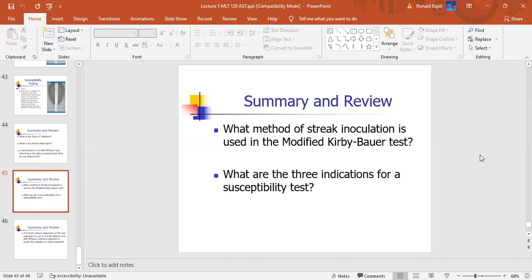The tube. So you do the slide. If it's positive, you stop because positive coagulase is Staph aureus. If you do the slide and it's negative, you don't stop because you're only testing for the bound coagulase. You have to make sure that there's no free coagulase.